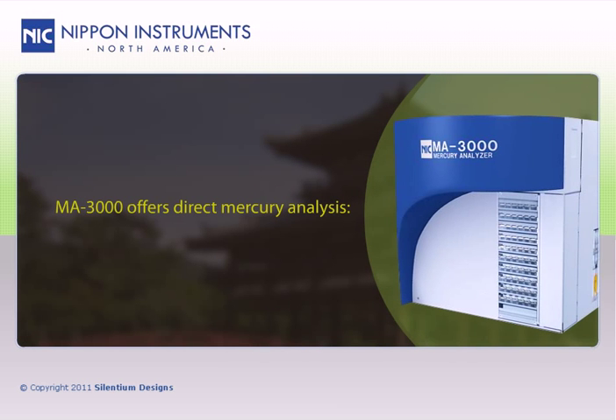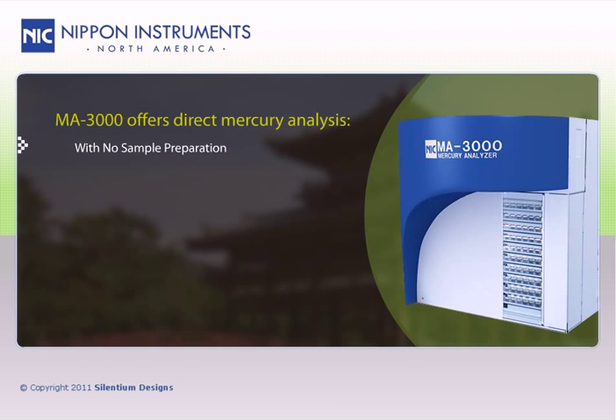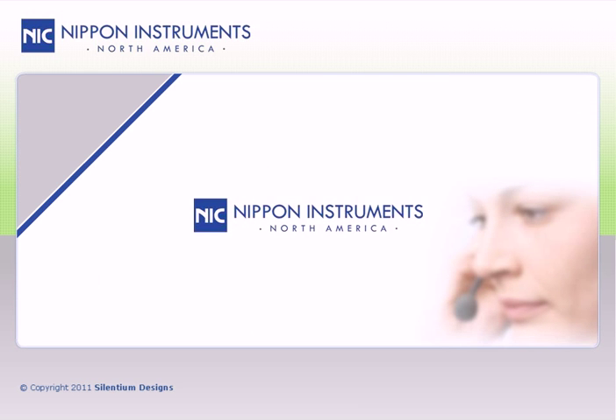The MA3000 offers direct mercury analysis with no sample preparation, wide analytical range, superior detection limits, 100-position autosampler, advanced automation, innovative optics, and user-friendly operation. For more information, contact Nippon Instruments today.